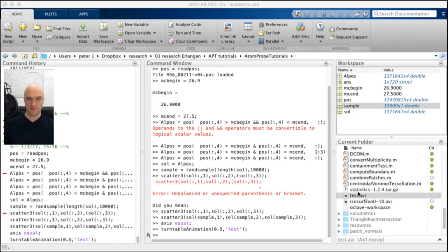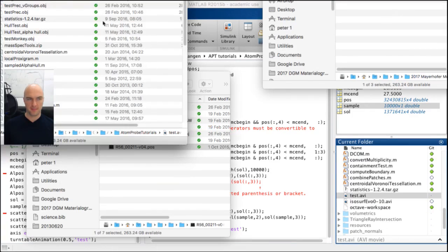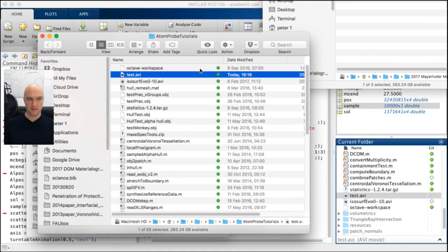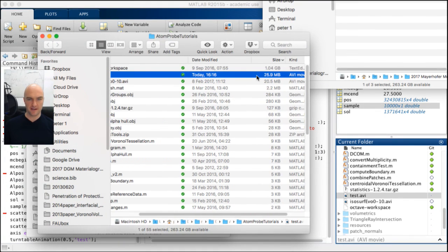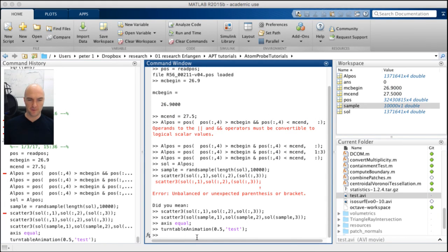Don't save the converted version. So here, just to show you, the size is then 25 megabytes, and I think that's a fairly reasonable size. You can go into that program and change the size you want, so you can down render and so on and so forth.